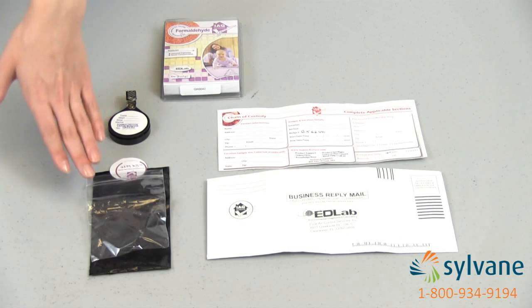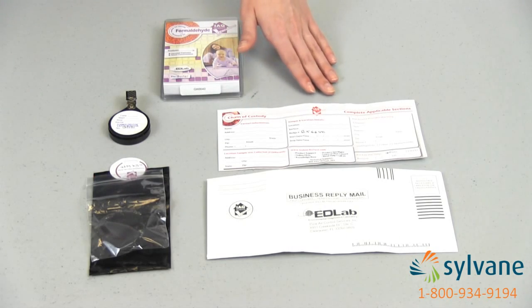Your test kit includes a bio badge, a bag, a chain of custody form, and a pre-addressed envelope.